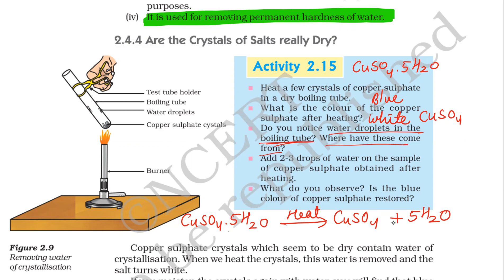These water droplets have come from this salt only. Now add two to three drops of water on the sample of copper sulfate obtained after heating. The white color of the copper sulfate — if we add a few drops of water, it will again become blue. What do you observe? It will again turn blue. Is the blue color of copper sulfate restored? Yes.